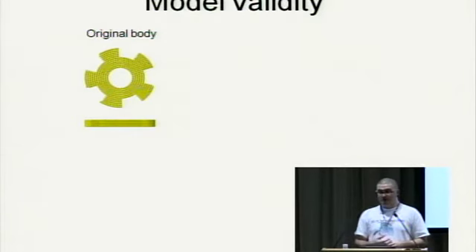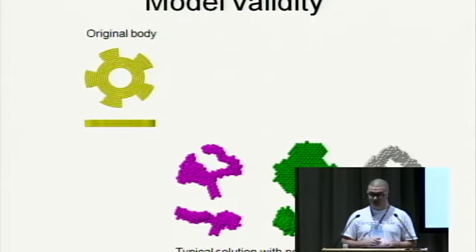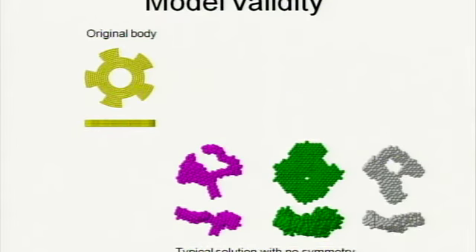However, if you even have decent data, remember I told you that you can come up with more than one shape that would fit your experimental data. And for certain shapes, the problem can be quite dramatic. For example, we took this flat disk, which has a P5 symmetry, and tried to reconstruct it ab initio, so like computed data from this disk, and tried to reconstruct it ab initio.